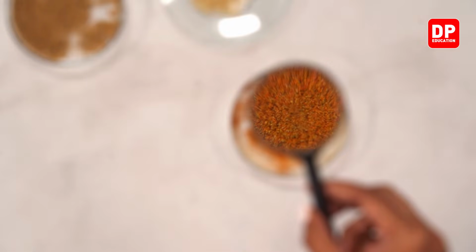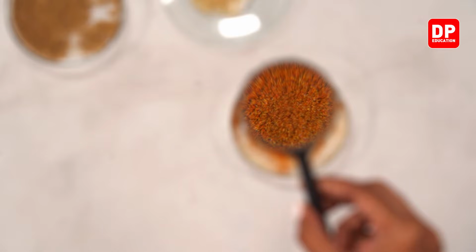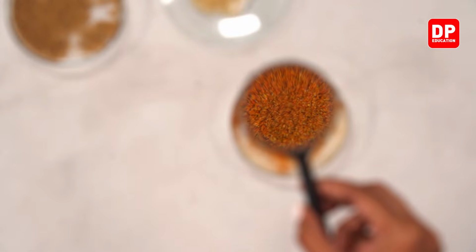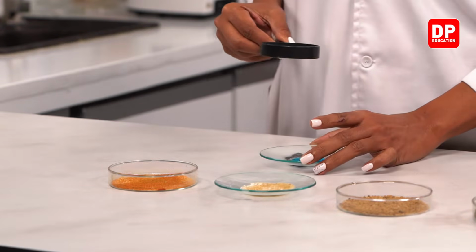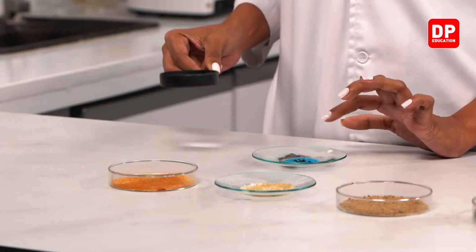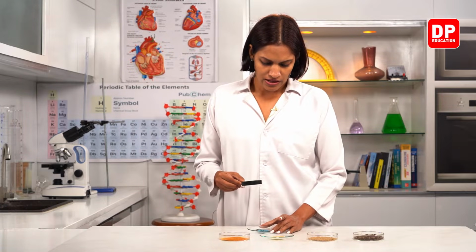Right? So using the hand lens, you can observe the different parts, different particles and other substances present in the mixture better. And here I have a mixture of chemicals. Look at this one. Can you all see? Now here you all can see some blue and black color substances present. When you use the hand lens, you can see this blue color substance as crystals. Very clear crystals can be seen.